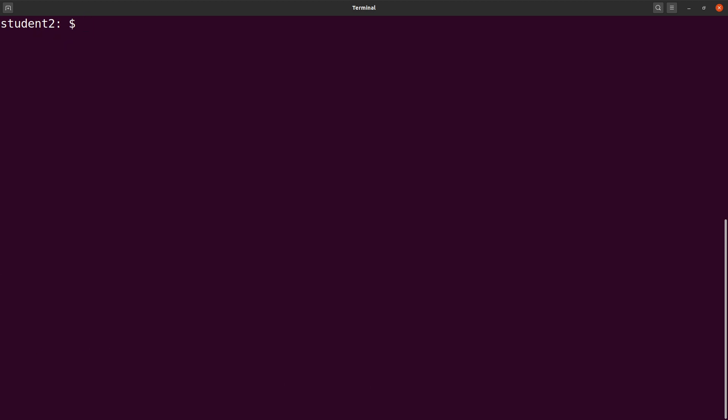We can now move on to the next step. You will then use fastq-dump to extract the FASTQ file. So we say fastq-dump, we specify that accession ID.